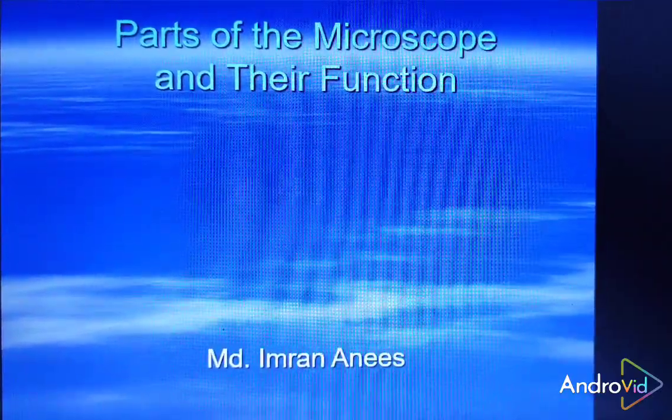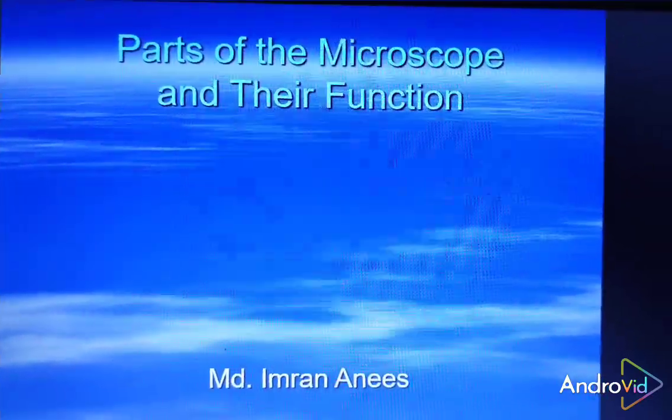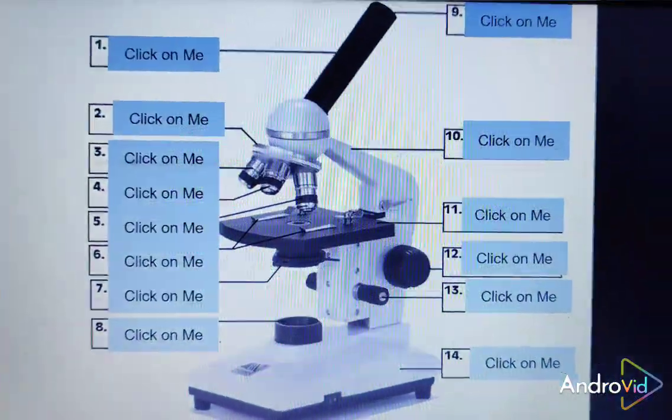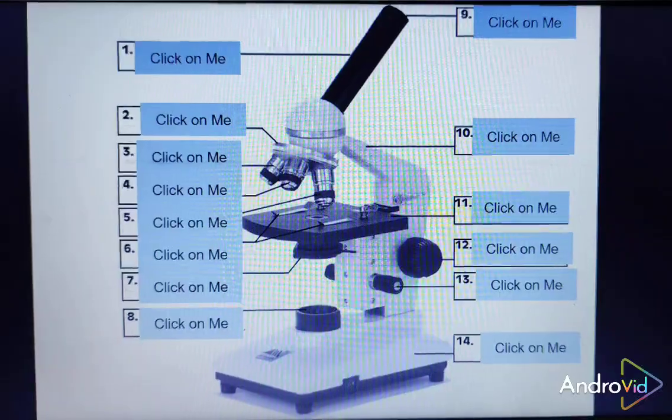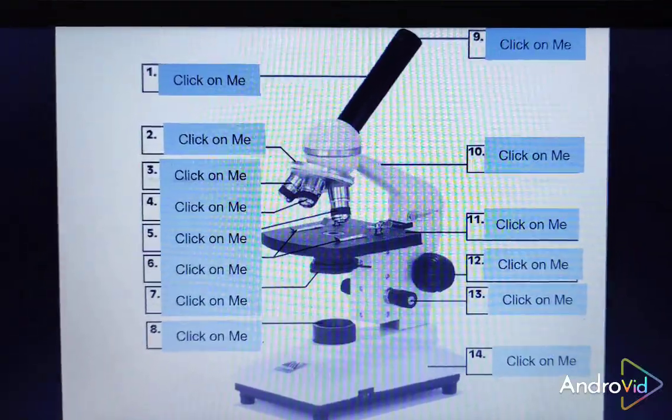Today we are going to see about the parts of microscope and their function. If you see over here, this is the construction of a microscope. We will go one by one with the parts of microscope.